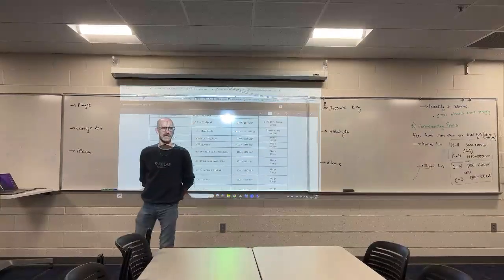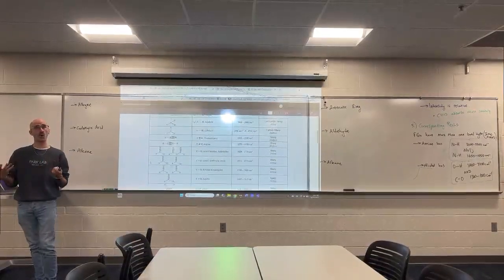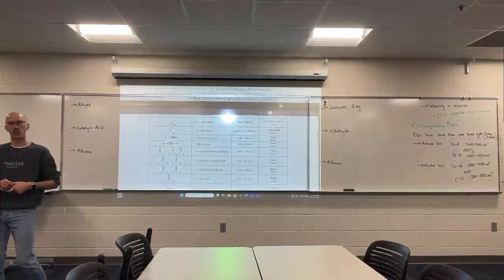Spend about 6 minutes on this. Use the correlation table and find how many corresponding peaks you would expect from your functional group.